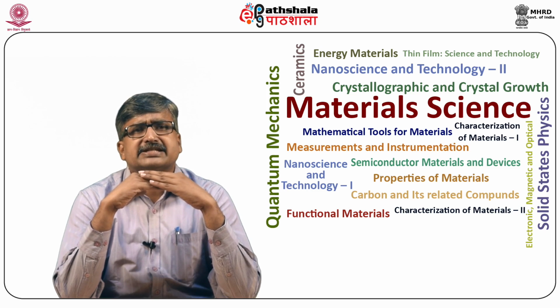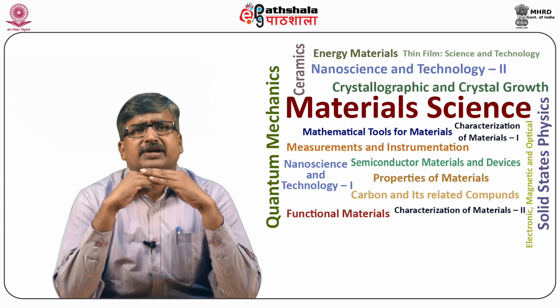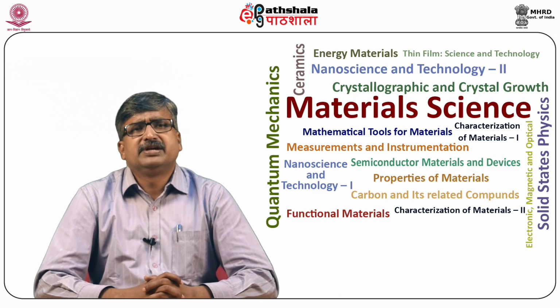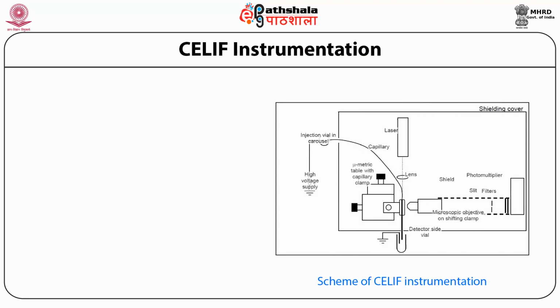Indirect fluorescence detection is typically less sensitive than direct fluorescence detection. However, it is usually more sensitive than direct UV detection. Another main disadvantage of indirect detection is that its universal nature could become a hindrance with extremely complex samples which may contain interfering species. Let us discuss CE-LIF instrumentation.